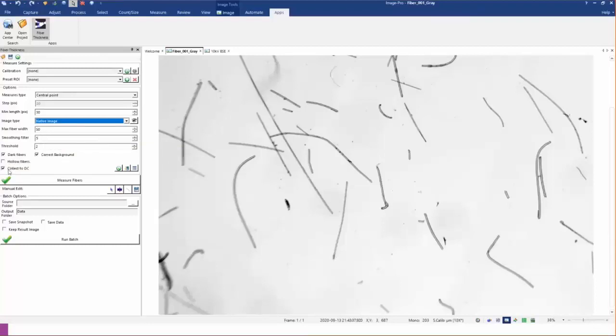Data collector. Every time I measure, it'll send the information to data collector, so keep that running data. I can always undo that and clear that out by resetting the table. Or while I'm testing and trying my parameters, maybe I don't want to send it to data collector each time and have to clear it out, and only collect it when I really want to. And then I can show data collector. So let's see how the default settings work.